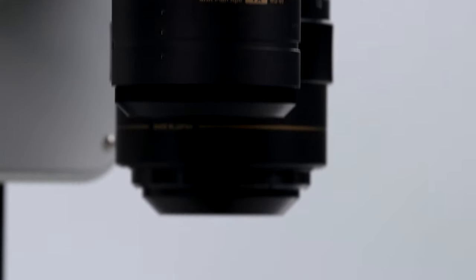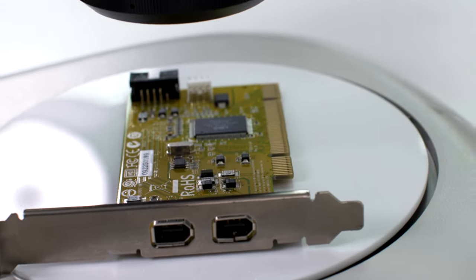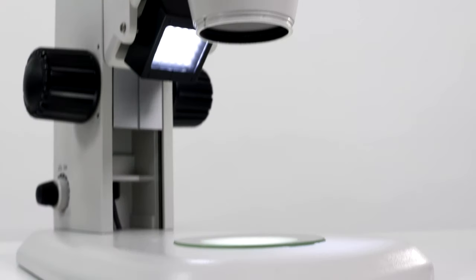All of the model groups are supported by their own range of supplementary lenses or prime objectives, so every microscope can be adapted to the tasks of any component being examined. For the prime objective microscopes, an optional lens revolver is available, so a second lens is always ready to be used rapidly.